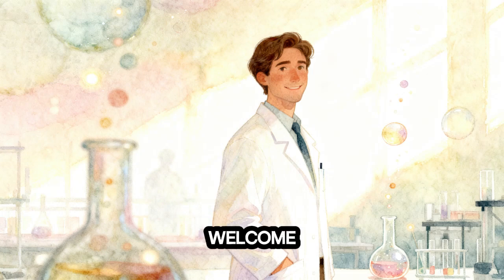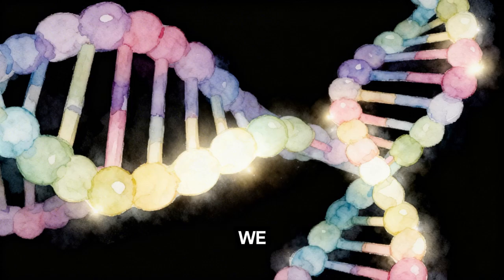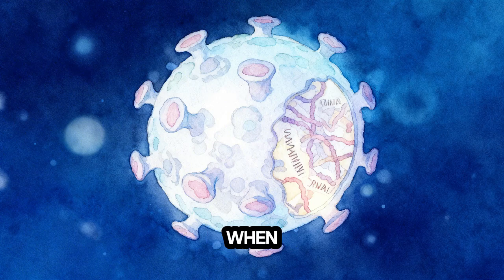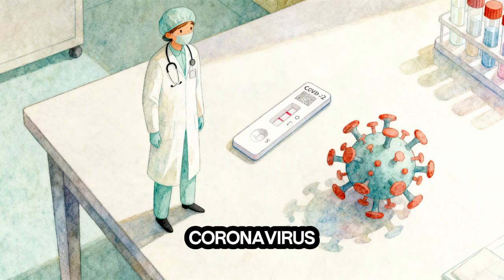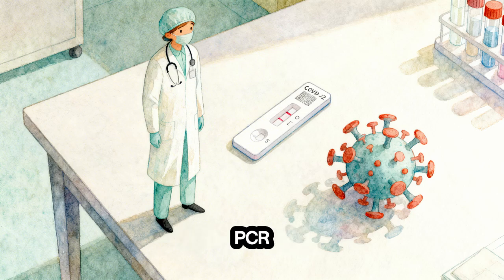Hey friends, and welcome to today's talk about the RT-PCR, which is short for reverse transcription PCR. We apply reverse transcription PCR when we have an RNA fragment, and we want to transform it into DNA so that we can amplify it to sequence it. For example, in the COVID-19 coronavirus testing, we use reverse transcription PCR to test patients and determine if they are infected.